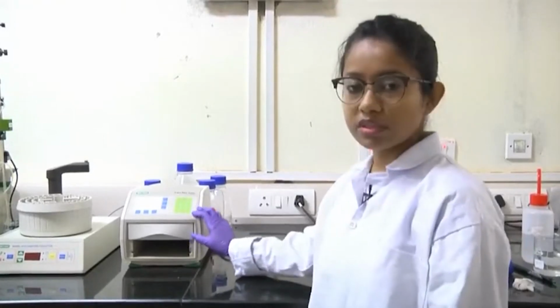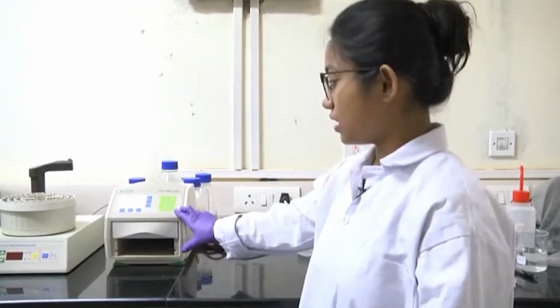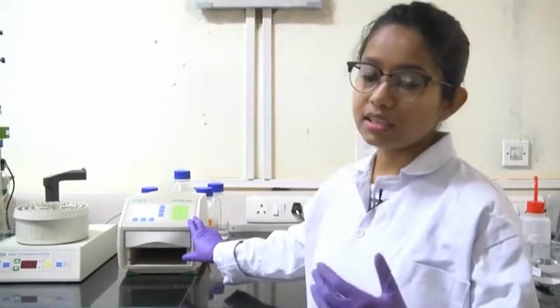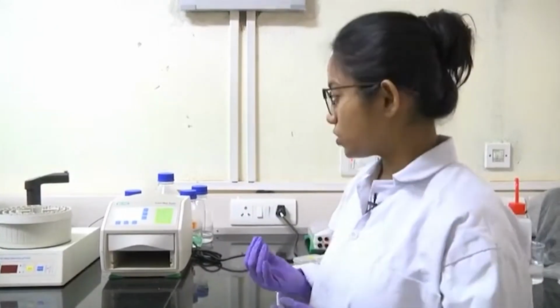So, after 15 minutes what we will be able to see is that the gel, or the ladder basically, because we can see the protein marker as it is pre-stained, we will be able to see that the marker has gone from the gel, the gel will be empty, and it has stuck to the membrane. After we see that all the protein bands that are present in the ladder have gone to the membrane, then we will stop.